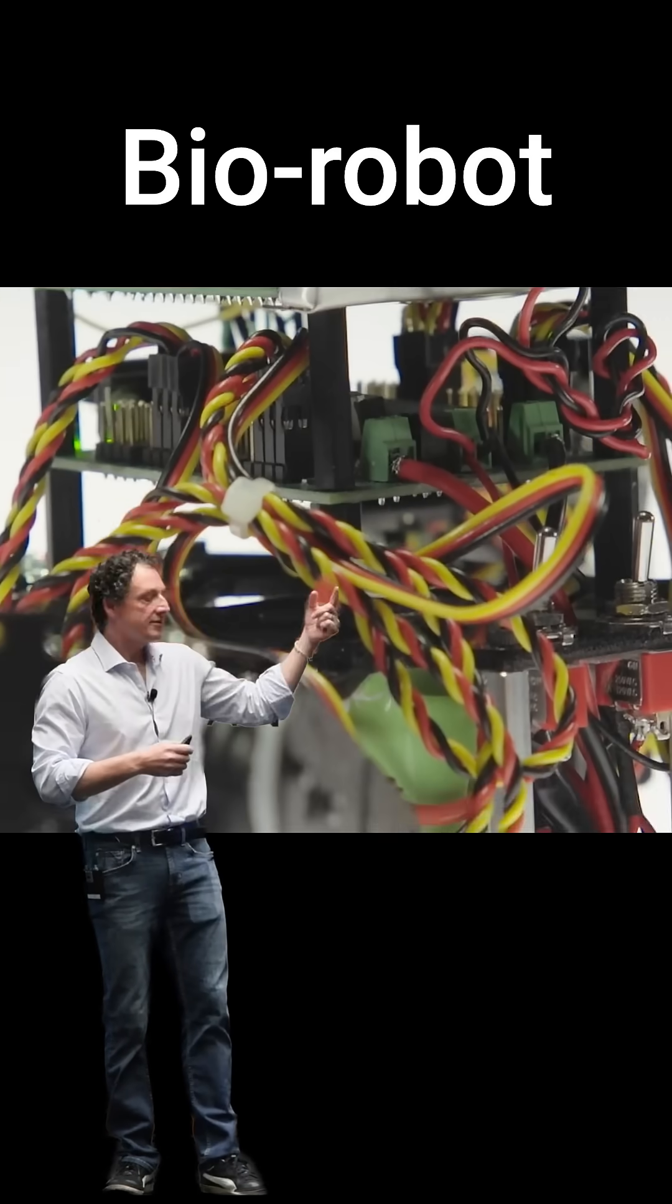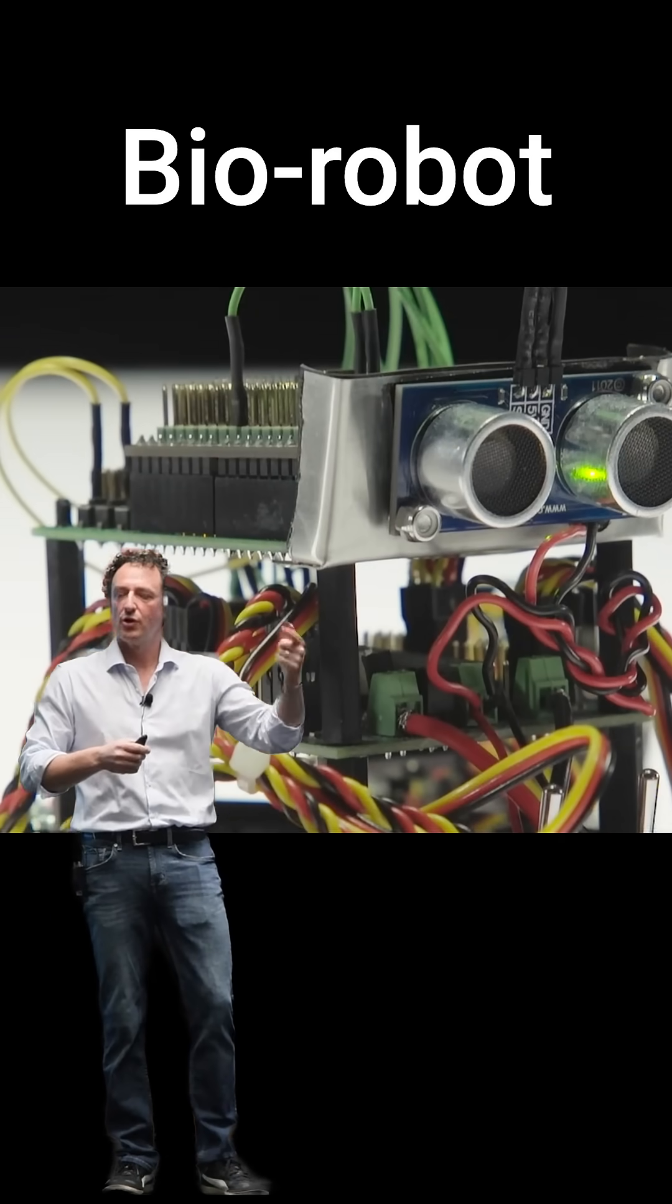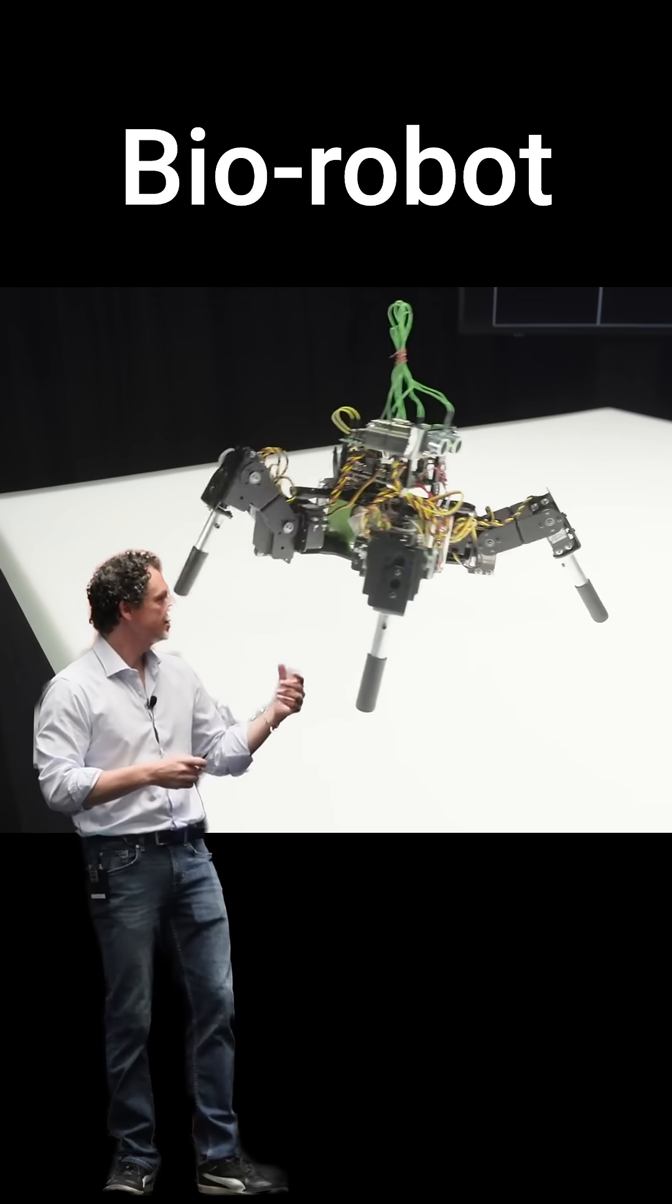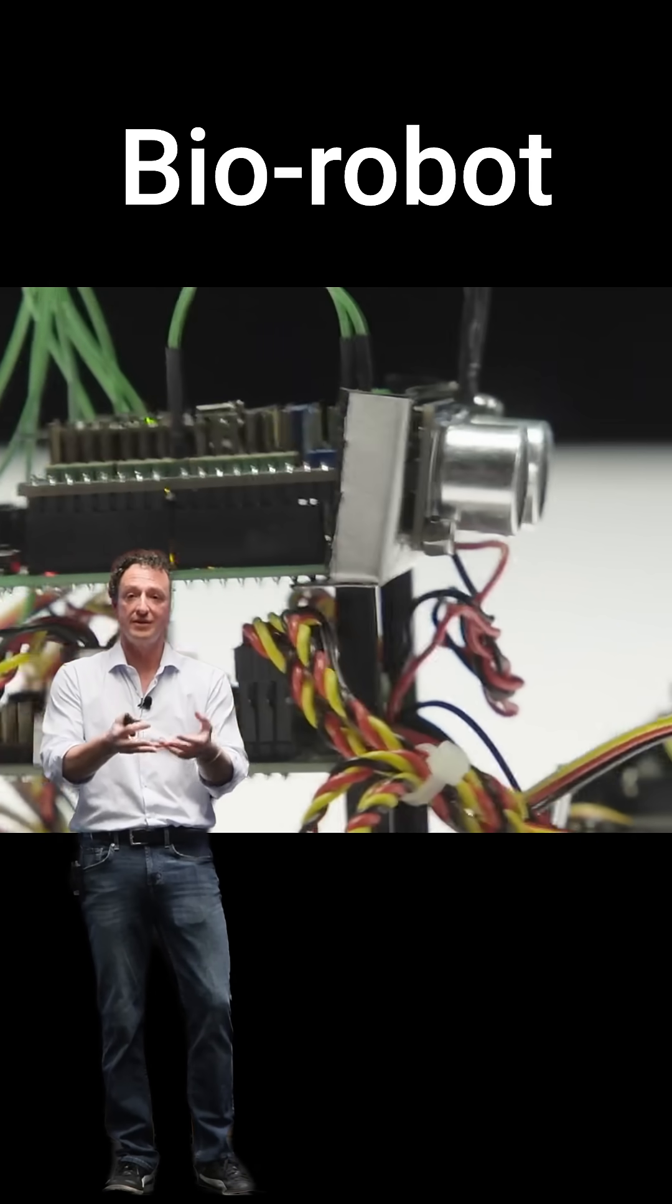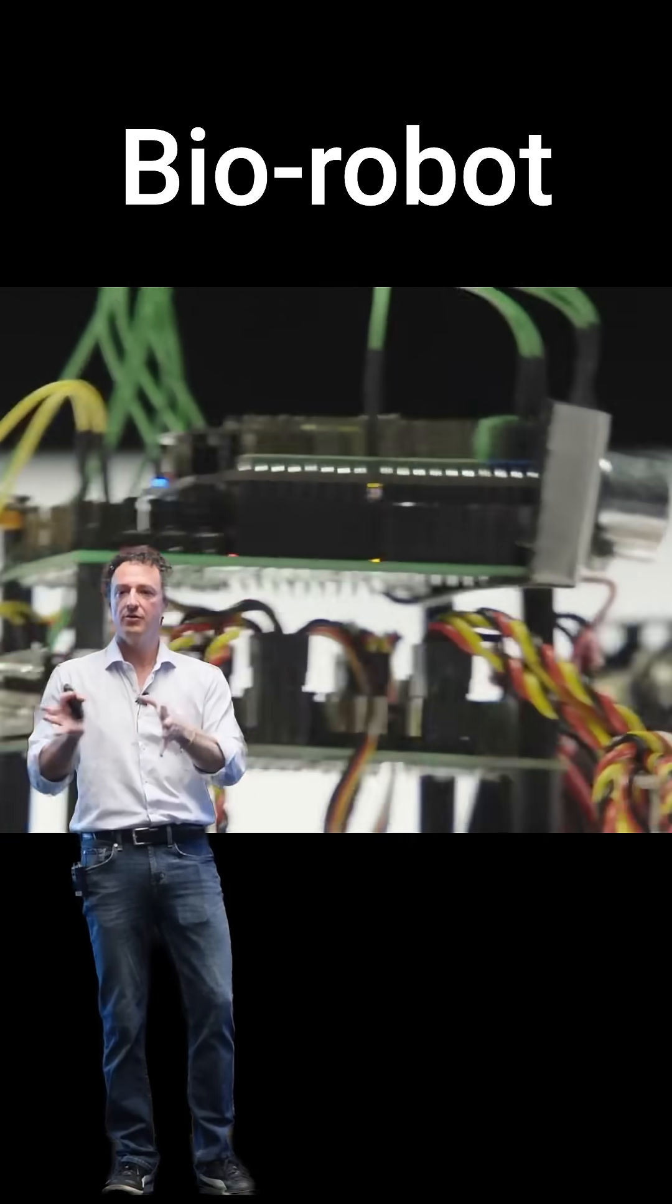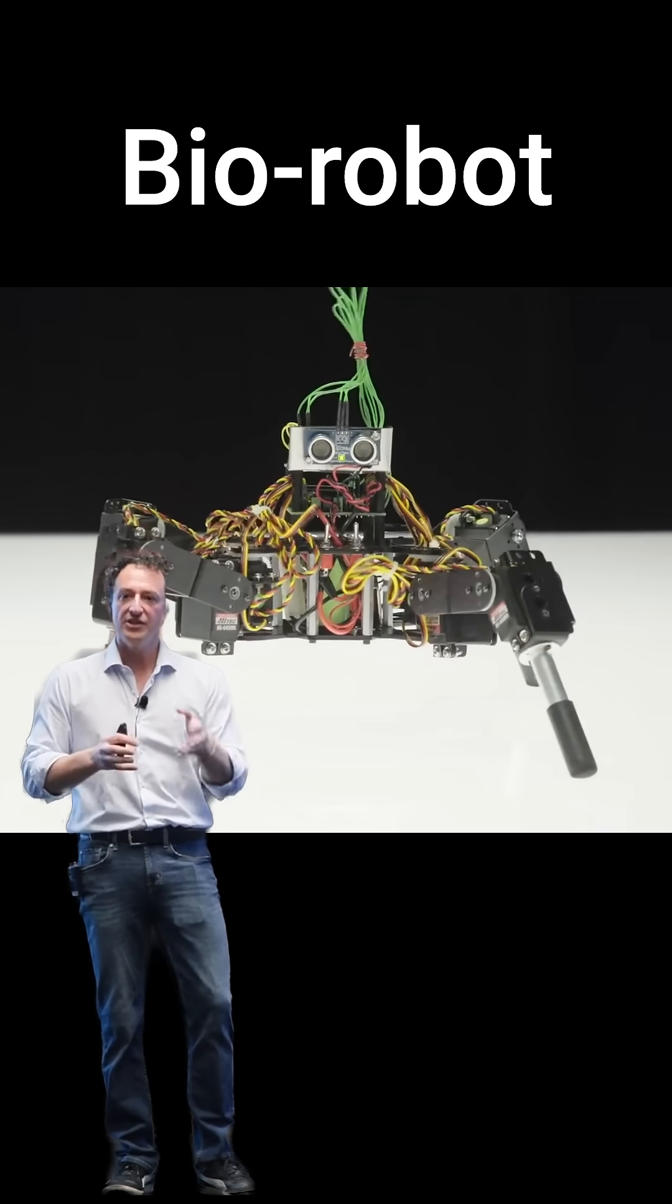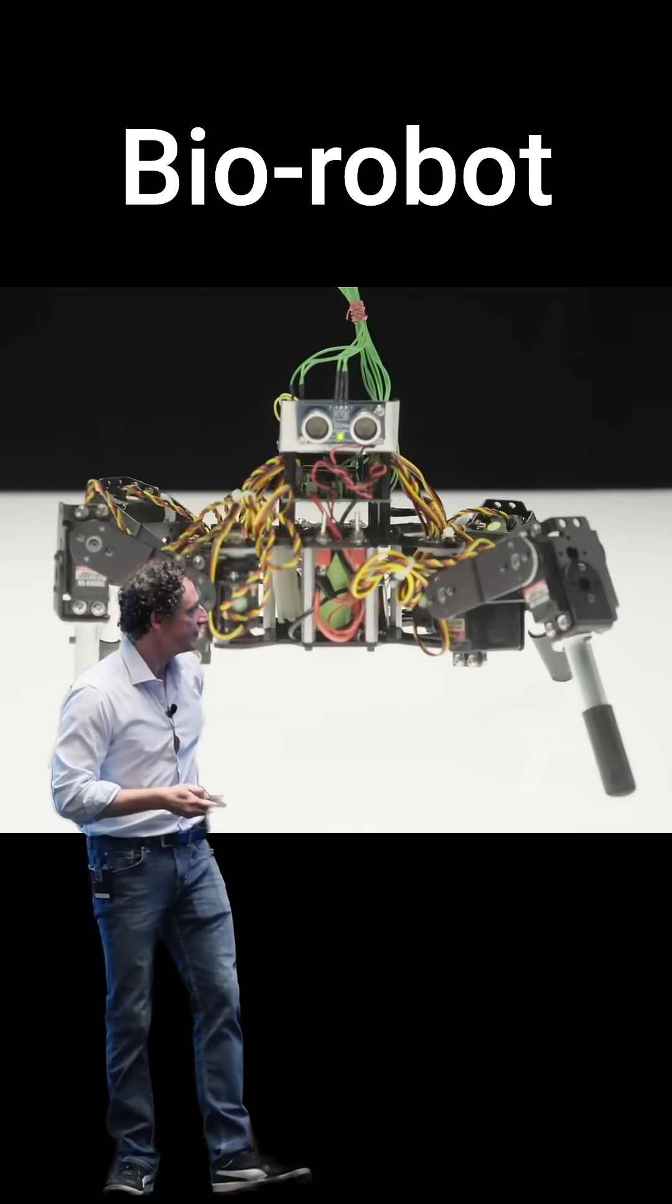By teaching these organoids how to move this robot, we are teaching them how to avoid obstacles. We can now place this robot in different mazes and see how they react. This is by learning just once, and they can do that quite efficiently.